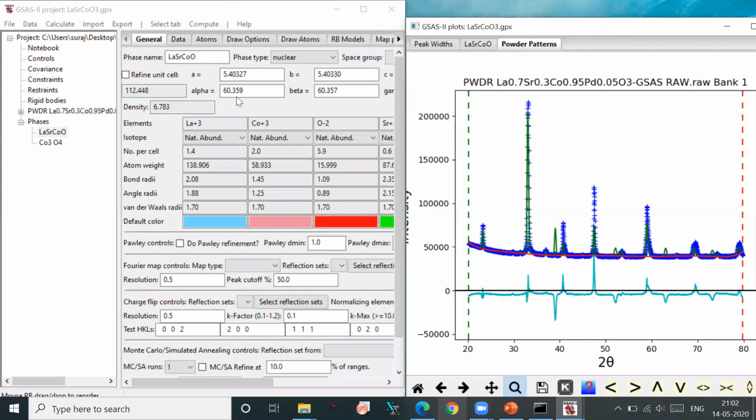What he's asking is that if it's partly amorphous, in that case the background will be very large. So if the background is huge, how do we take care of the fitting? Yes, one can perform the refinement, but the problem is the reliability of that simulation.